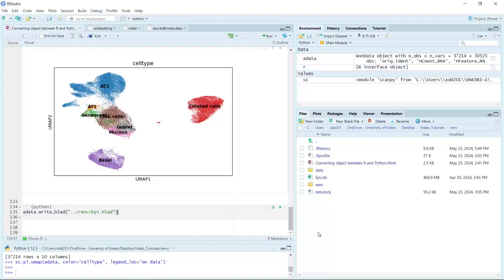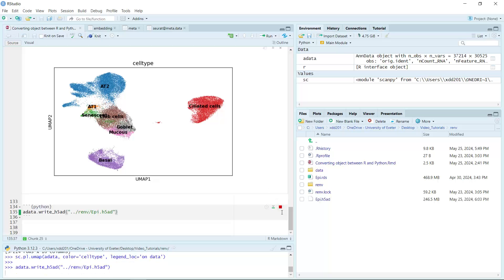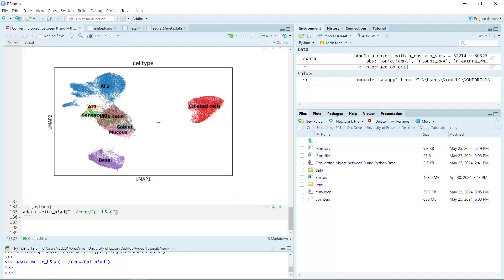It will be saved in my R environment folder. You can see at the moment we only have the Seurat RDS object here. If we save the data and run — now you can see in the folder we have an H5AD data object. We converted it from the Seurat object to an AnnData object, and we have the same UMAP for the AnnData as the Seurat object.